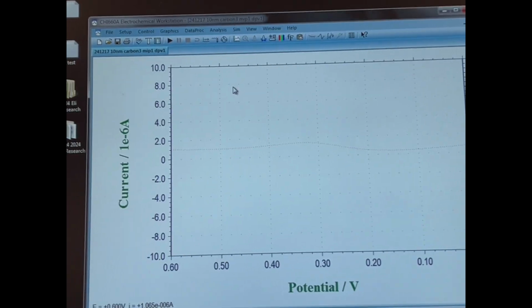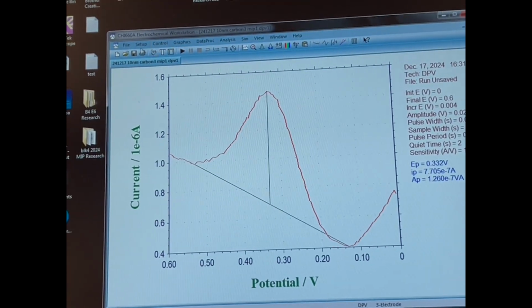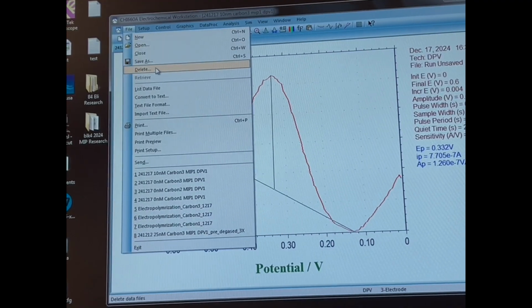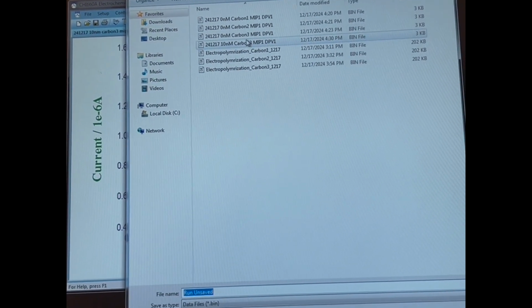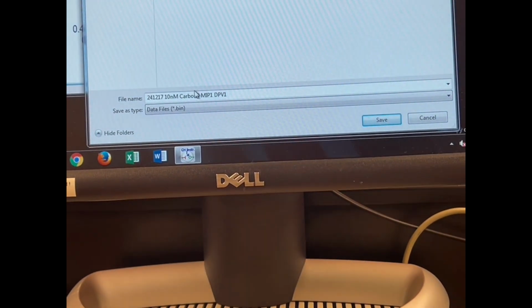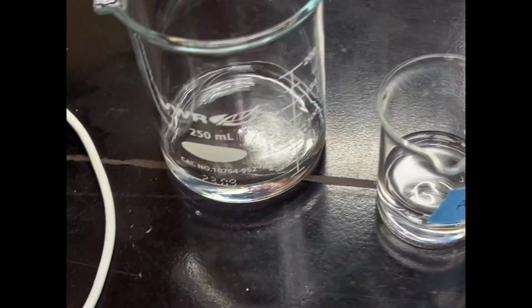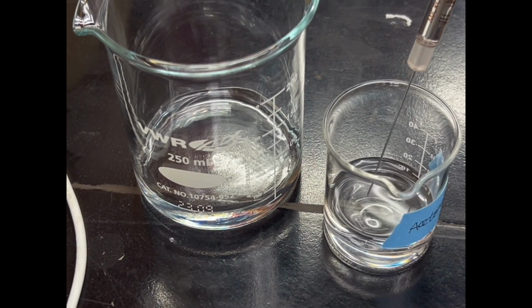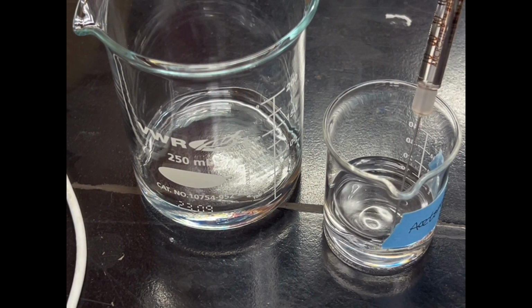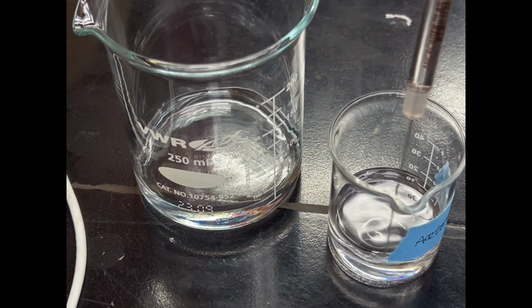The next steps are basically the same. Just inject maybe a different volume of PFAS. Just make sure we clean the Hamilton syringe very well with acetone for the next use of the syringe.